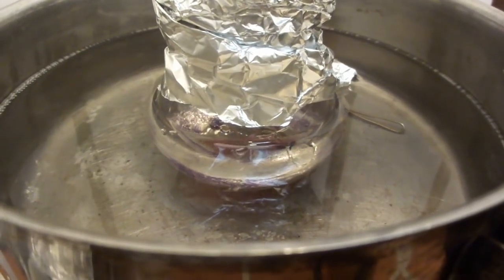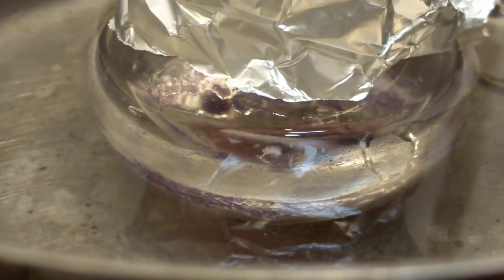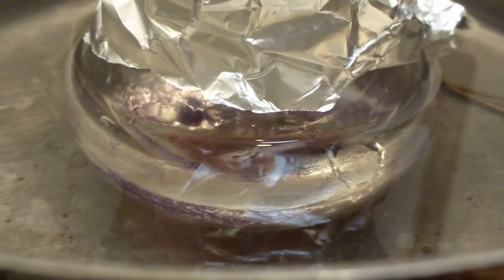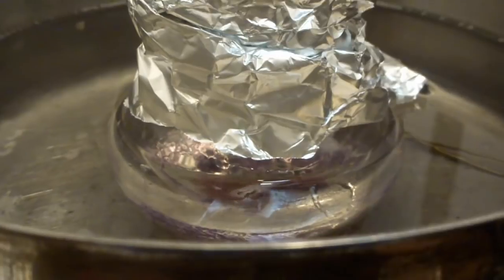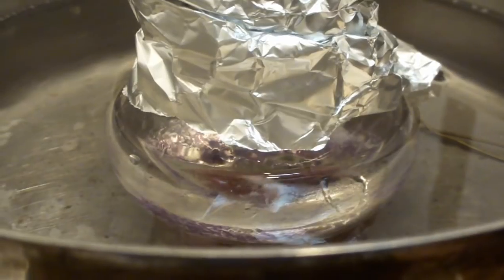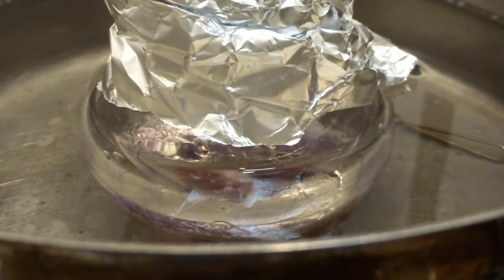So as you can see, the volume in the flask has decreased quite a lot, and also the drip rate in the receiving flask has slowed down to a minimum. At this point, you can turn down the heat and let the apparatus cool down. In general, you would never distill to dryness, since you could drive off some higher boiling impurities. In this case, there's nothing really there that would come over at higher temperatures.